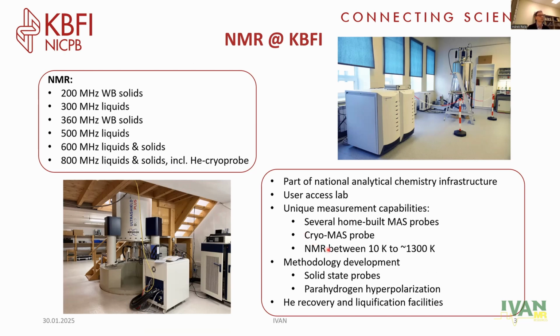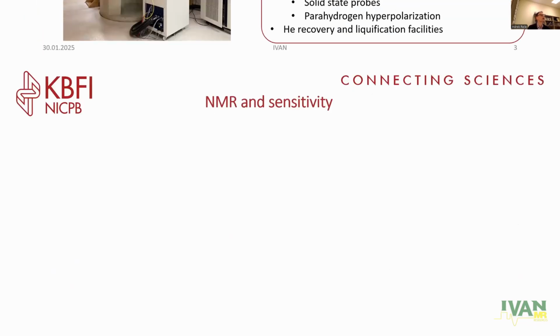And we still maintain a capability to do NMR between 10K to well over 1000K. So there is some engineering experience here to allow us to build stuff to do things that otherwise might be quite challenging to accomplish.